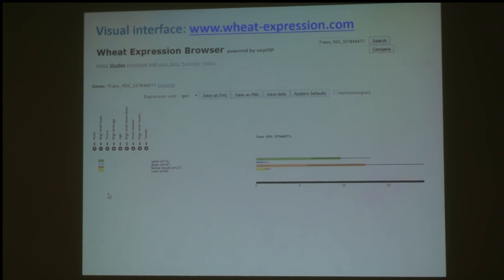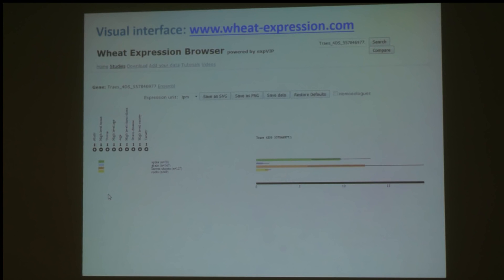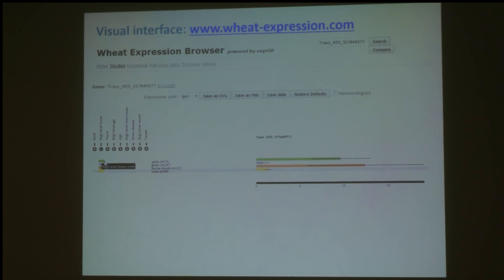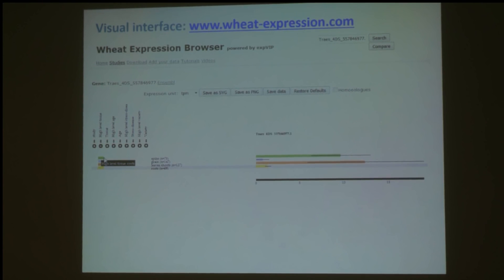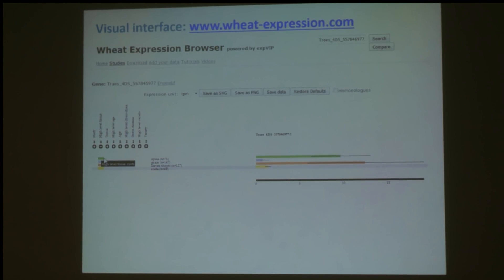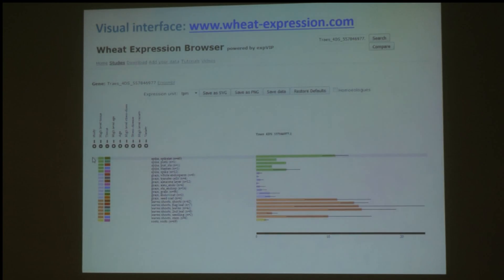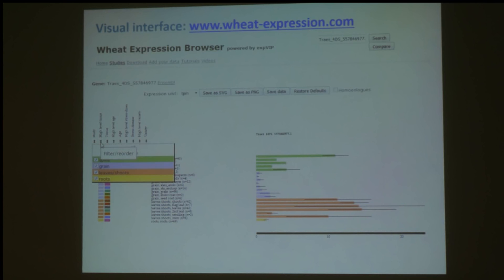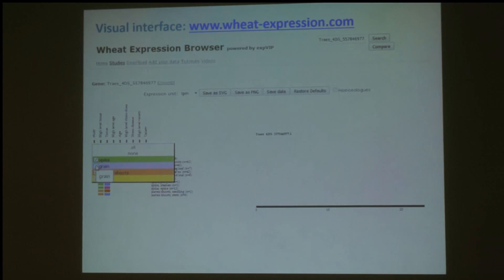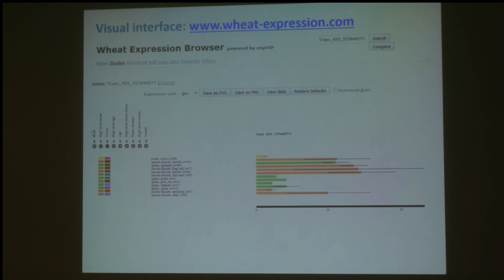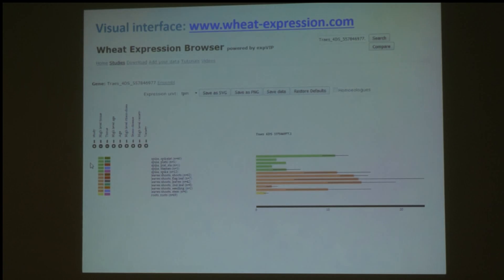If we start looking for our favourite gene of interest, when you search for a gene you can see different information. In this case we can see the different tissues where the gene is expressed, and you can add more information about which tissues it's expressed in. Instead of just having one category of spike, we now have the different components of the spike split up into five different green bars. We can also remove categories we're not interested in — for example, expression in the grain was quite low, so I've removed that tissue completely and resorted by the remaining tissues.